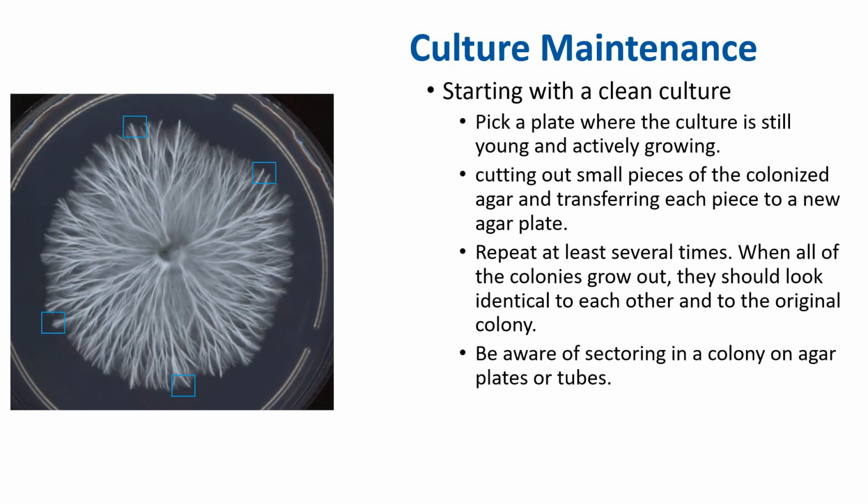So when you receive a culture or start your own mushroom, you need to make sure that the culture is pure, free of other fungi, bacteria, mites, and contaminants. To do this, you can't really look at your plate and say, hey, this is completely pure, right? This culture looks pretty clean here, and you can assume that it's clean, but you really want to test this by transferring it, right?